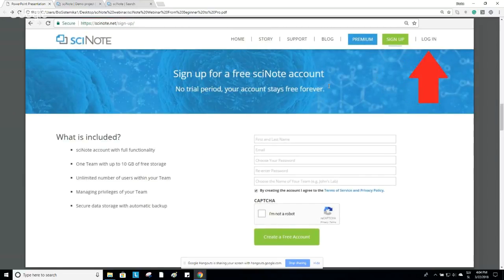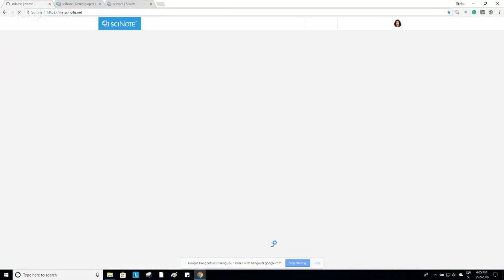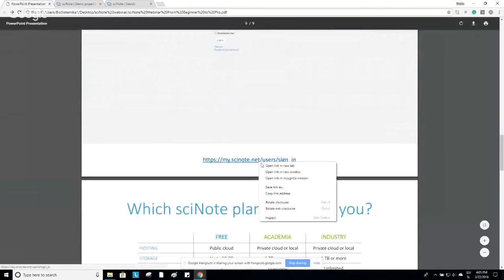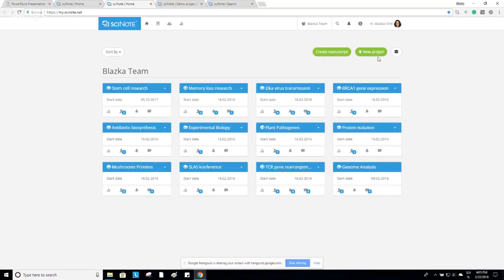If you already have a SciNote account, just log in on our webpage as well. So you just need to enter your credentials, your email, your password, and just press the login button. Okay. So now I have logged into my SciNote account.